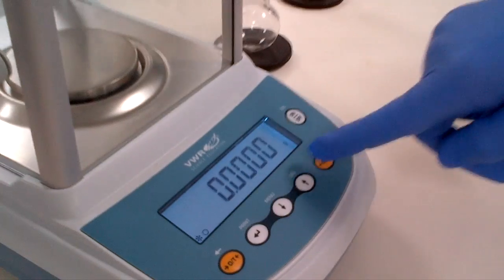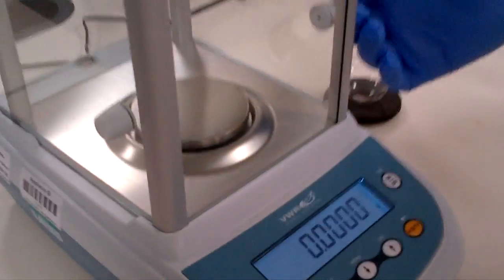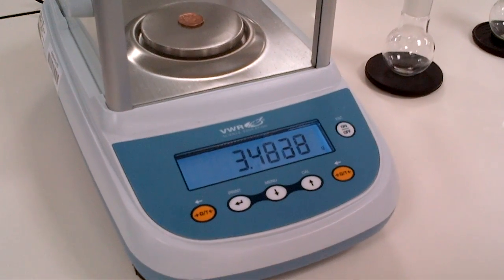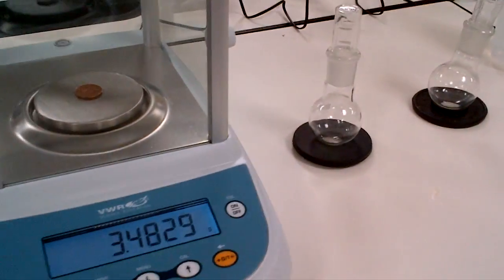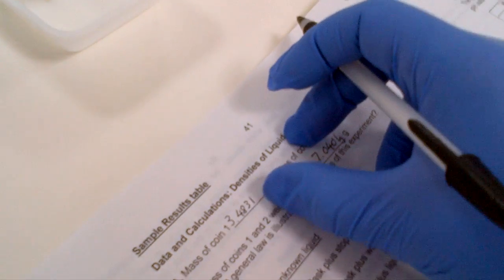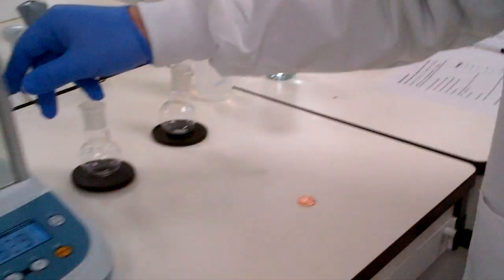The balance here has a tare button. Make sure that this reads 0. If not, press the tare functionality. This is fine, and put the weight of a coin on, or coin disc, onto the balance and record it at 3.4828. So enter that measurement into this part of the table, 3.4828. We've already done this before, we're just going back over what needs to be done.